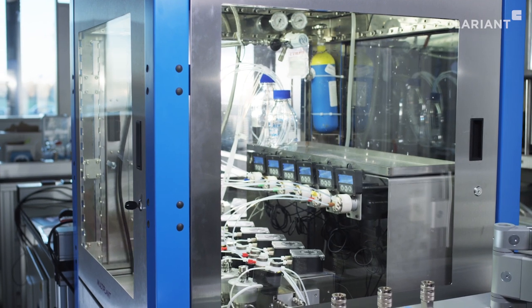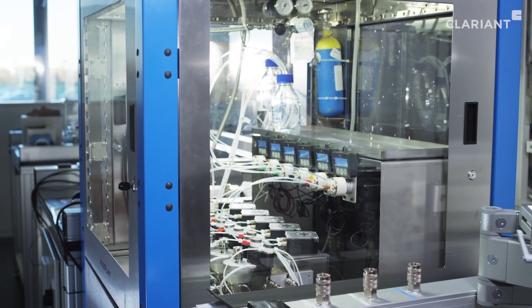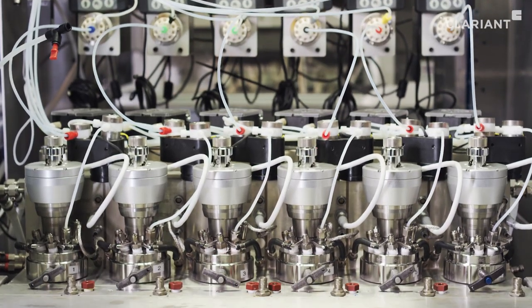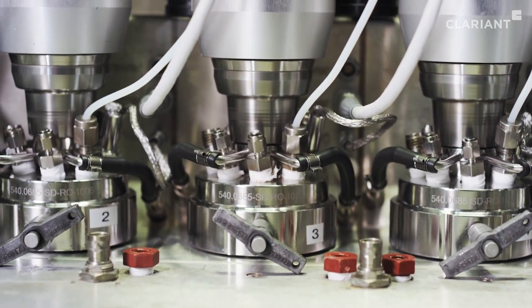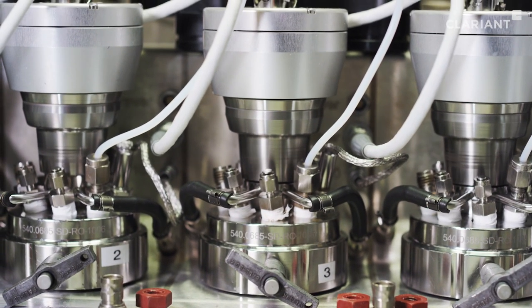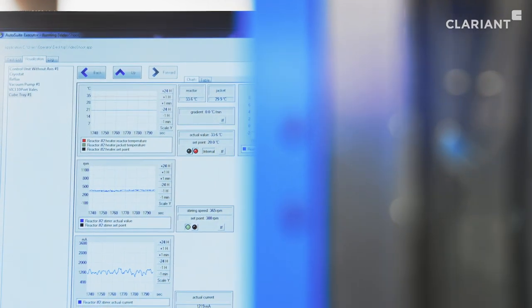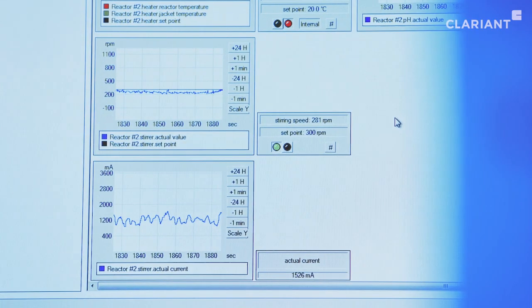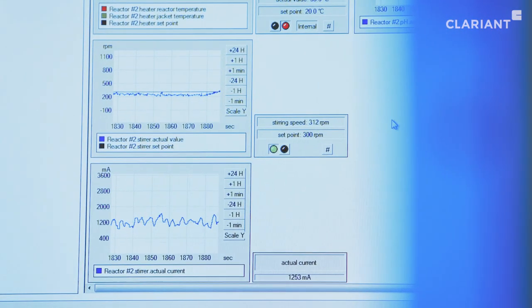Our synthesis capabilities are enhanced with a process development system which is able to operate six individual tank reactors at the same time. Optimizing process conditions is facilitated by real-time analytics and feedback controls.